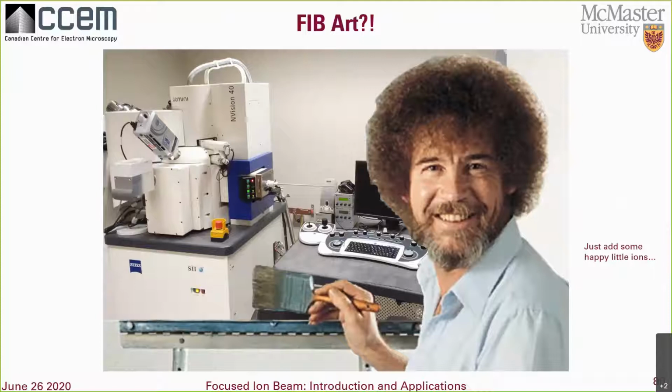If you have a creative mind, you might have wondered whether FIB can be used artistically. Yes, it can. But usually we're busy using the FIB for science, so it's quite uncommon beyond people milling their university logo into their sample. But using much of the same techniques that I've already explained here today, FIB can be used to make microsculptures. I've done it before, the media loves it, and in reality, I think it's an underexplored use of FIB. Pretty much anything you make will probably be the world's smallest of that thing. And here are a couple examples.